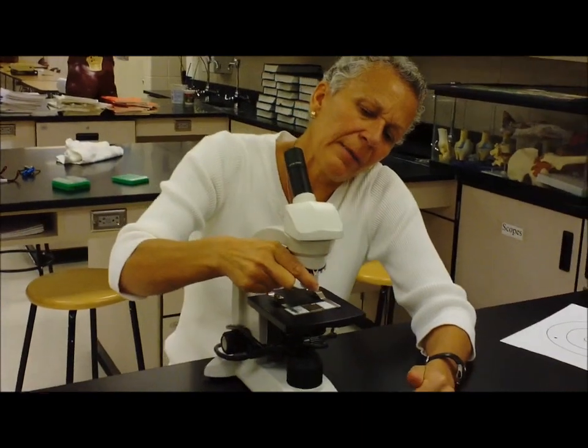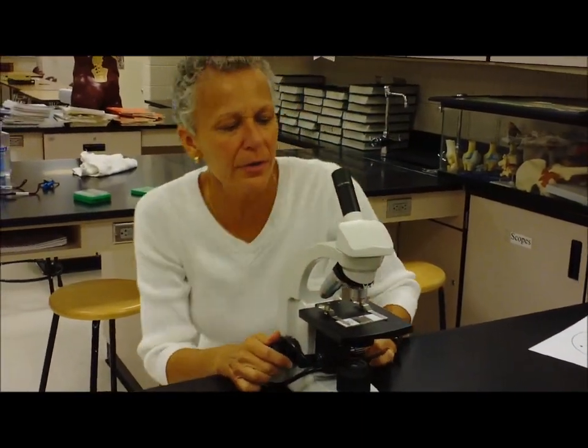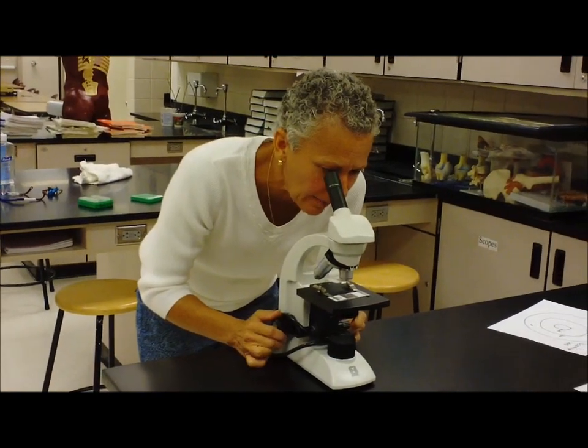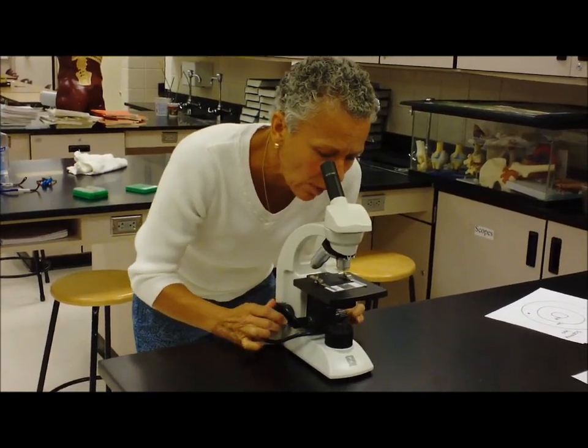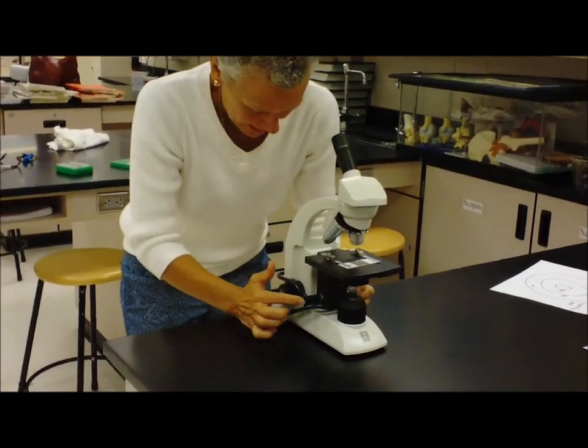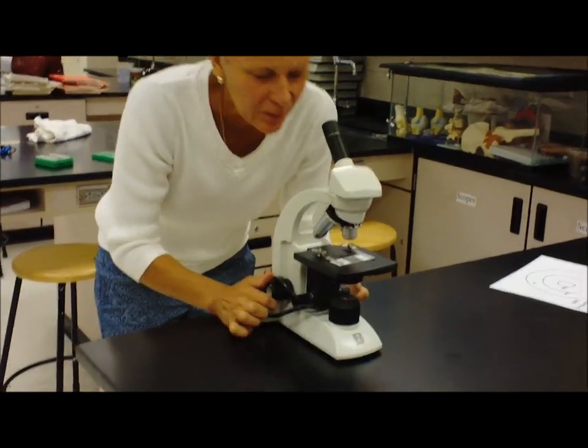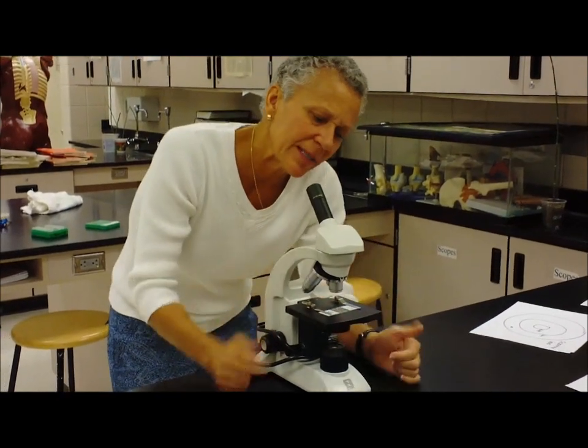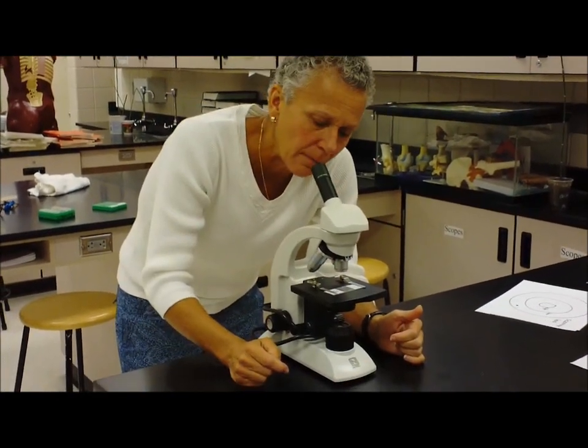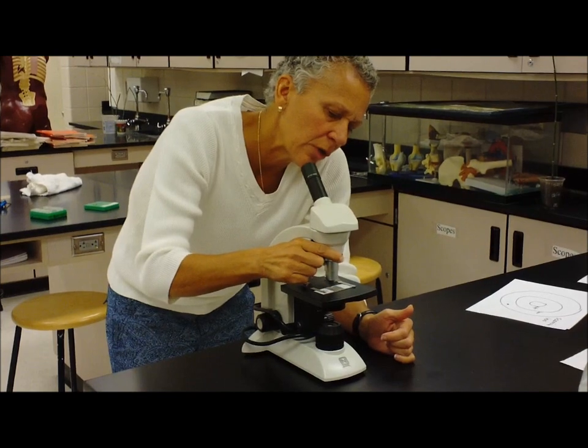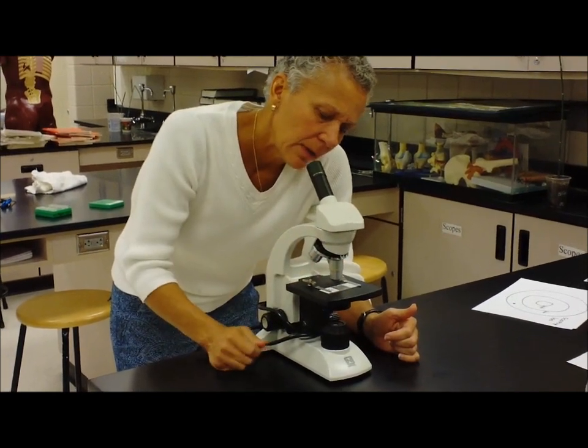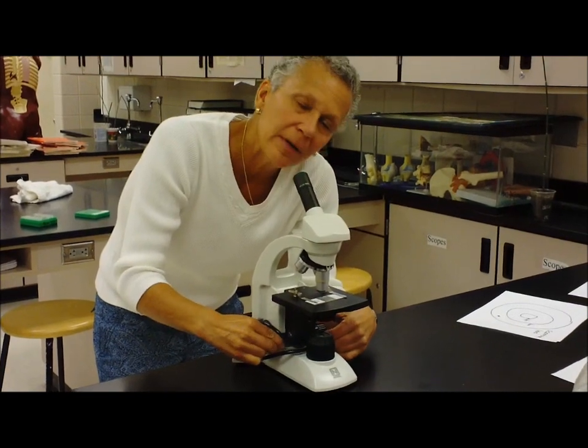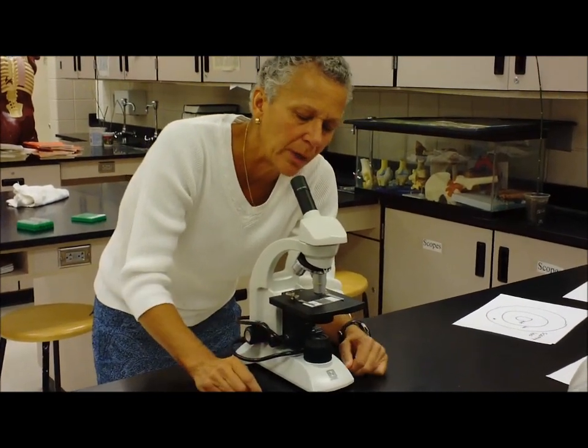Alright, so starting again I'm going to focus this under the scanning lens. I want to keep just one eye as I'm looking at my object. And I can use both the coarse adjustment knob and the fine adjustment knob to focus my item. Once I've focused it, I want to make sure it's centered in my field of view. Then I'm going to switch to the low power lens. And hopefully all I have to use is the fine adjustment knob to make my object look really clear.